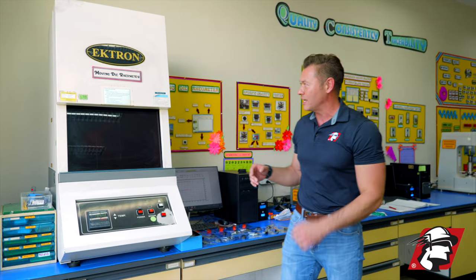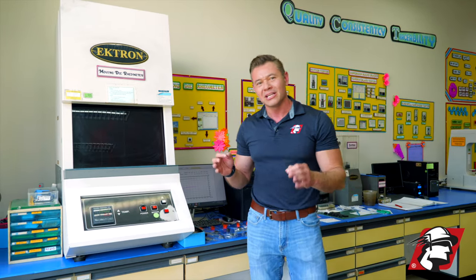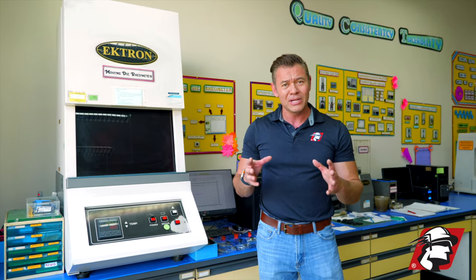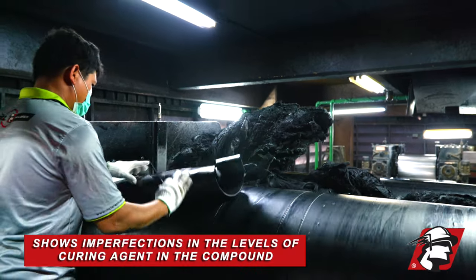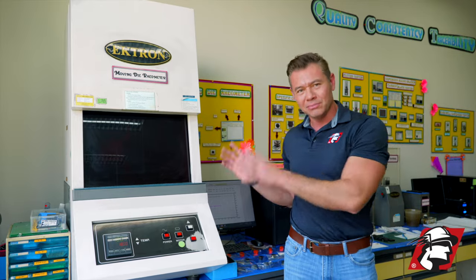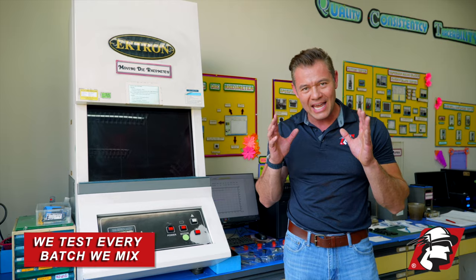This is one of the machines — it's called a moving die rheometer. What does this do? This tells us the cure curve, or how fast the compound is curing. If for some reason there's too much curing agent in the compound, or too little curing agent, or something wrong with the compound, this machine is going to show us that.